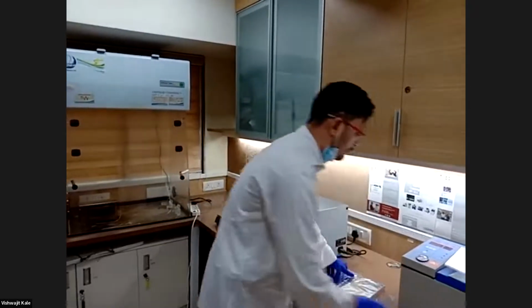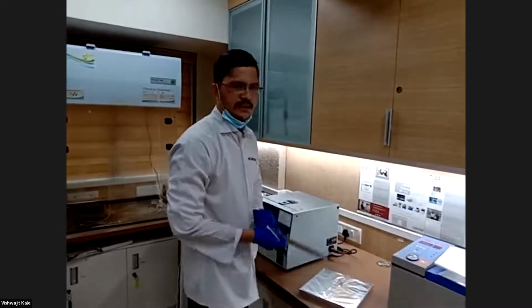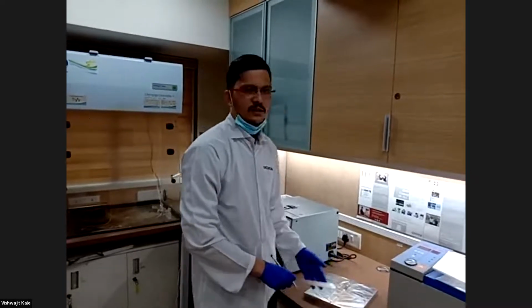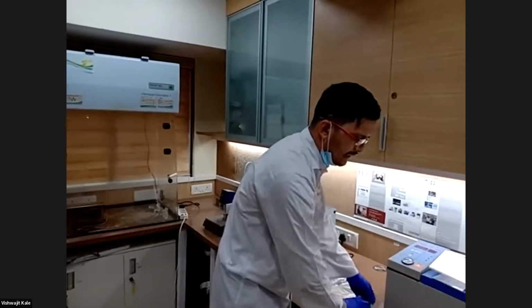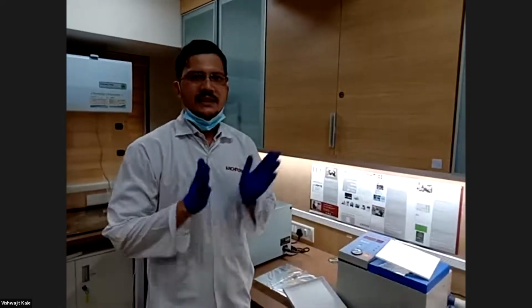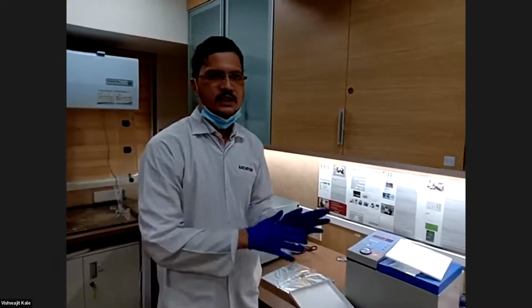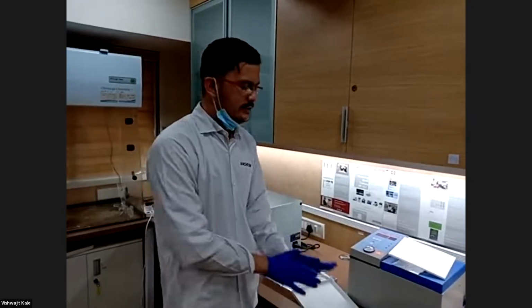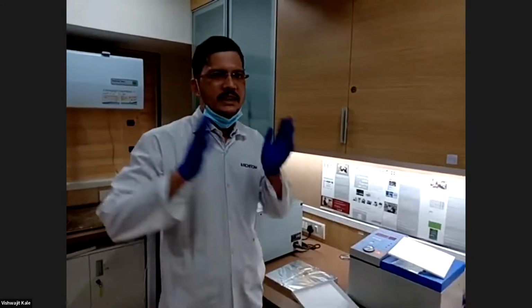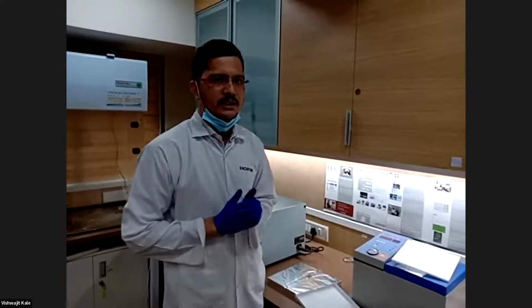So this stage we have prepared, having capacity for plate cutting of 20 by 20 centimeter dimension. Any plate smaller than that size we can cut on this surface. Before any analysis, we are selecting the plate, and for cost effective methods and the fastest and most accurate analysis, we always prefer TLC normal phase plates first, which are very cheap in cost. We are always trying to develop very cost effective methods by keeping the Indian market in mind, and all other requirements and laboratories in mind.